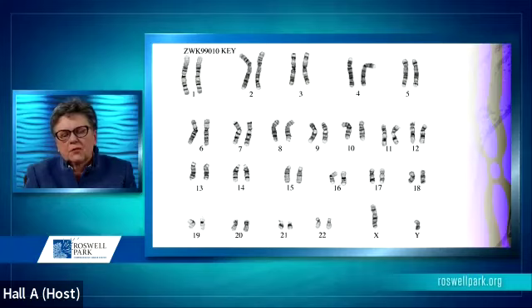You should also know that the position of the centromere is useful in identifying the chromosome. Some chromosomes have the centromere, or primary constriction, at the center of the chromosome. Others have a distinctive shorter and longer arm. And chromosomes 13, 14, 15, 21, and 22 are considered to be acrocentric chromosomes. These chromosomes only appear to have a long arm.